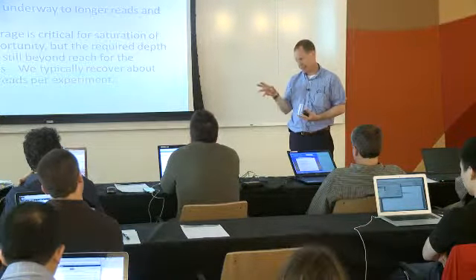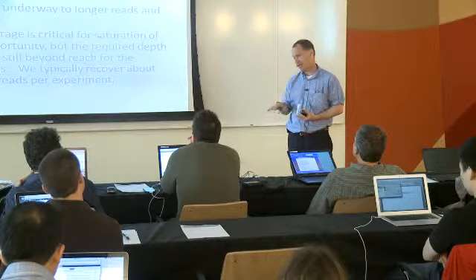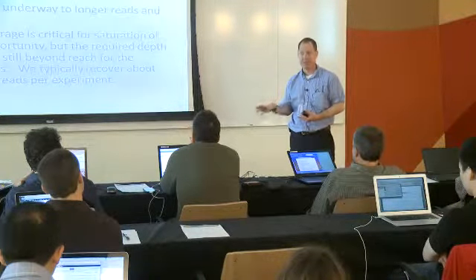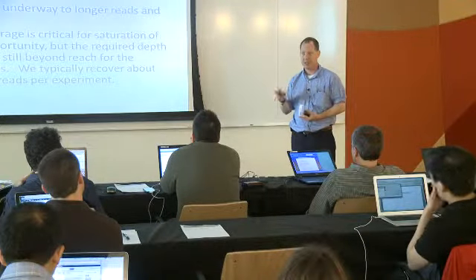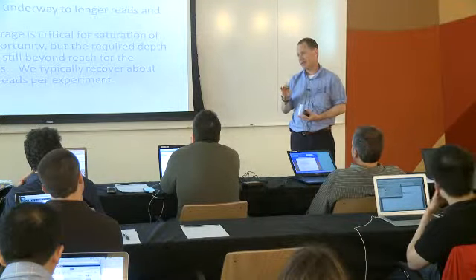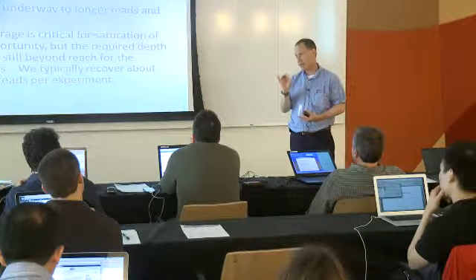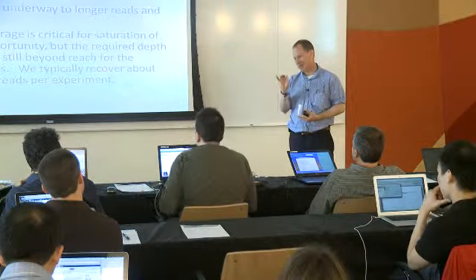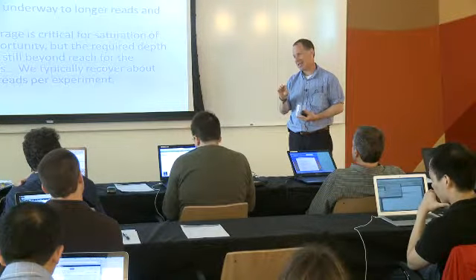In yeast studies, where the genome is just a couple percent of the size of the mammalian genome, the sequencing depths that you can achieve do enable detailed phasing of histones, where you can actually say with some precision, from an affordable quantity of data, where the histone is sitting with respect to the DNA sequence.